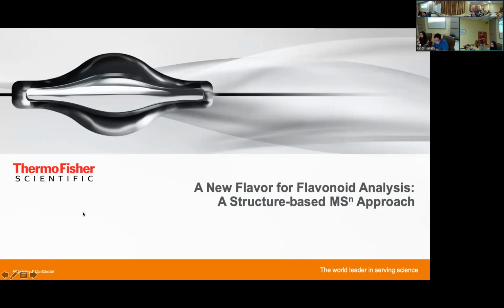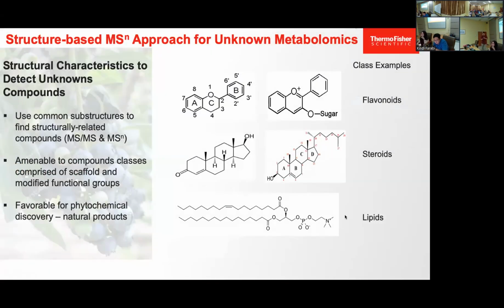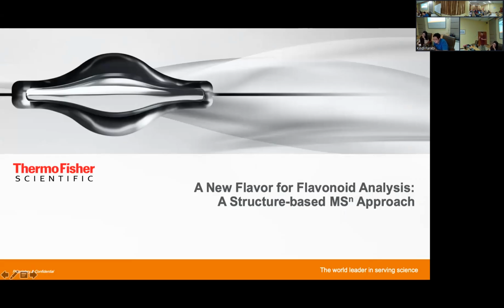So this is actually the structural basis of MSn. We will mention MSn. MS is no fragmentation. MS2 means that I infuse the gases to let it fragment. MSn means further fragmentation. So why we need to do so much fragmentation is to identify and confirm the structure.